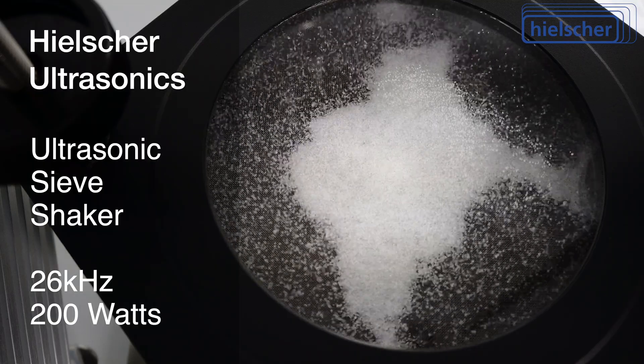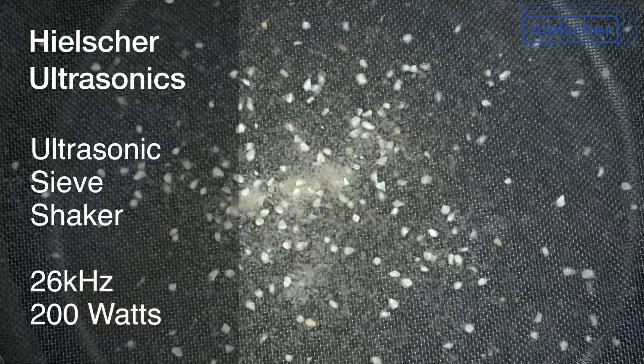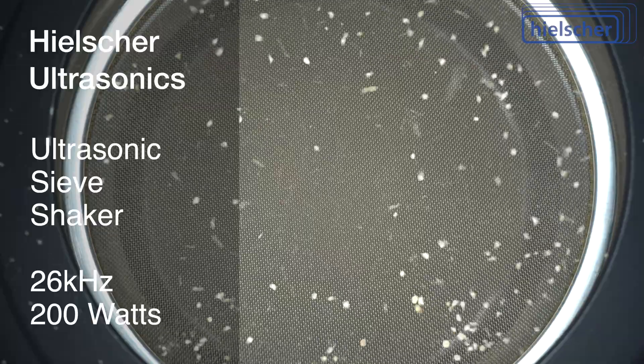Mineral or metallic powders, pigments or powder coatings, crystalline materials, spices, soil samples, cement powders, or ceramic mixtures — the Hielscher ultrasonic sieving system is suitable for most all materials.